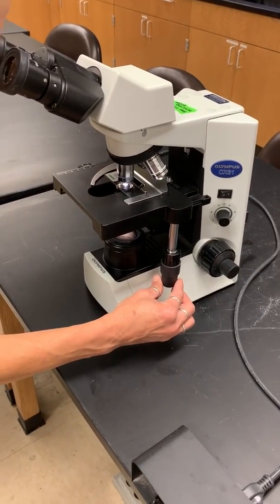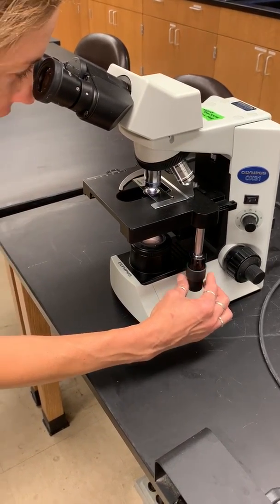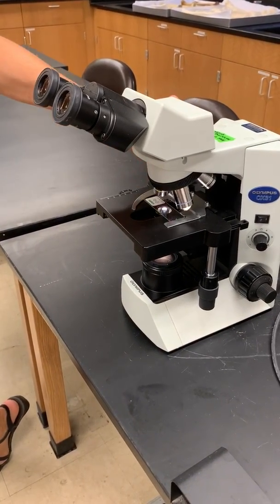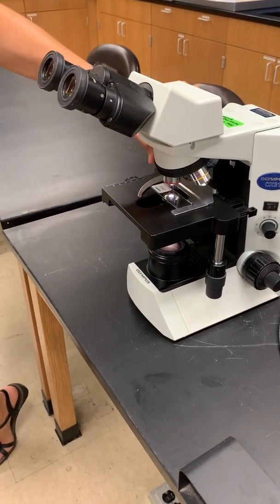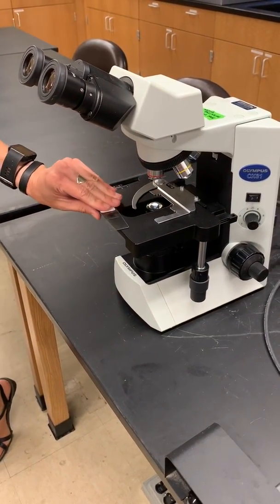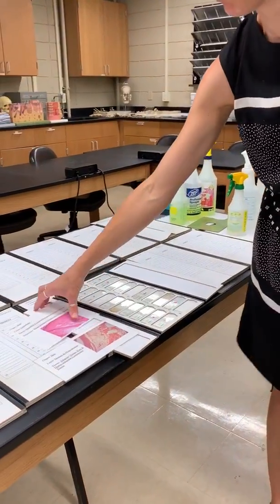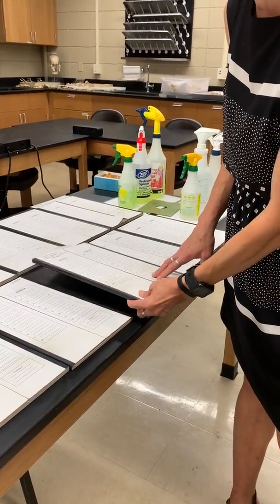You can move the positioning knobs and look around within the slides — you can look at different parts of the tissue. When you're done looking at it, you always want to go all the way back to your low magnification. Put the stage all the way back down, because we've got to start back down here to look at the next slide. Then you can just pull it out. Make sure all the slides stay in their appropriate boxes, and when you're done, set the cards back in neatly for everybody else.